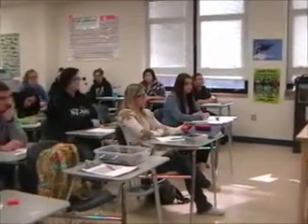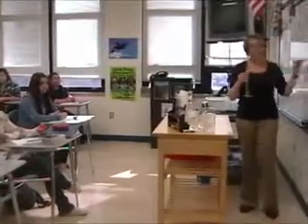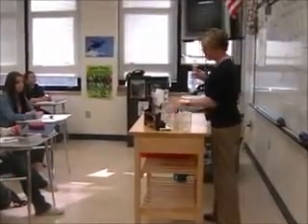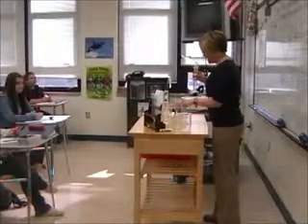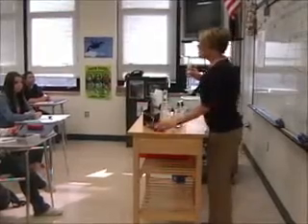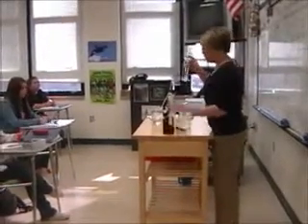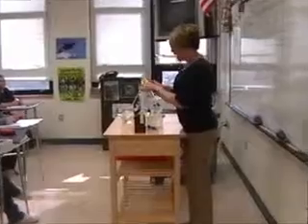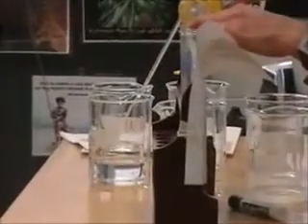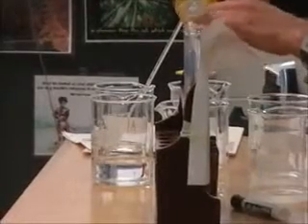At 21 degrees Celsius, our time was 7.5. So what do we think is going to happen to the time it takes for this to happen? It'll decrease. Okay, we think it might decrease. Because of that, we need to be ready with our timers. Put your fingers on the yellow button. I'm going to add, here we go, ready? Start.